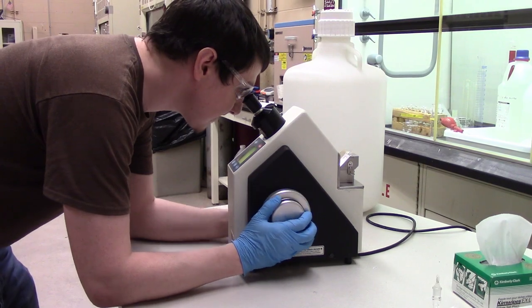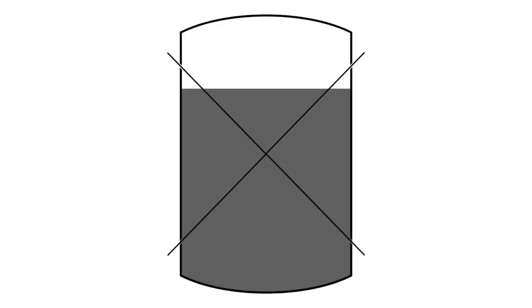While looking into the microscope, turn the wheel on the right side of the device until you can see a sharp border with a lighter section on top and a darker section on the bottom.